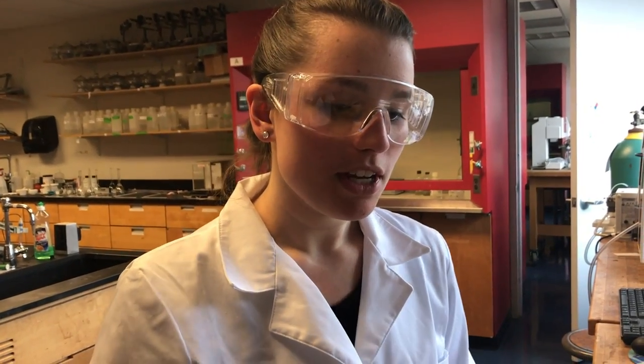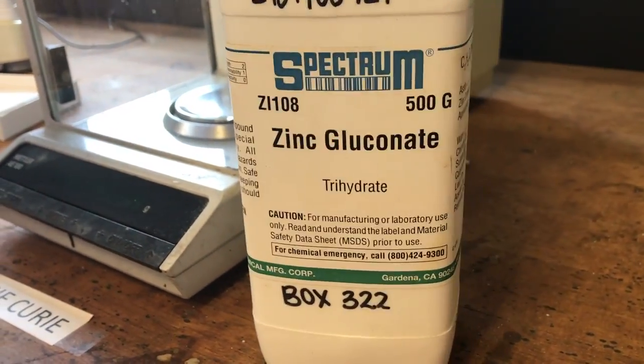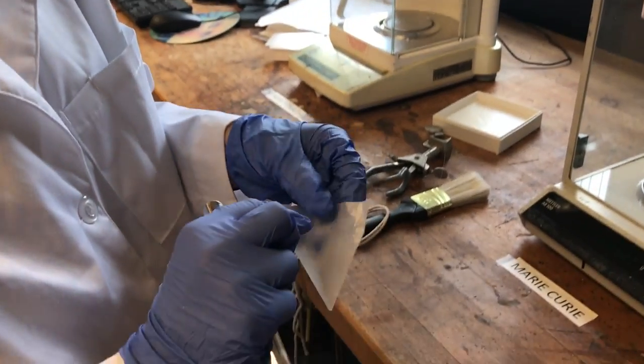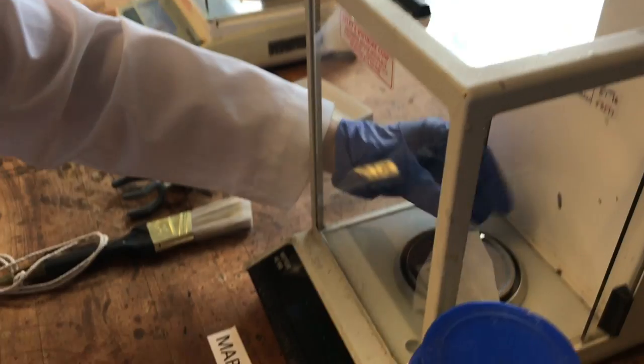Next we're going to show you how to prepare sample number two, which includes weighing out 0.1 grams of the zinc gluconate. In order to do this, you're going to want to fold the weighing paper and then tear it.